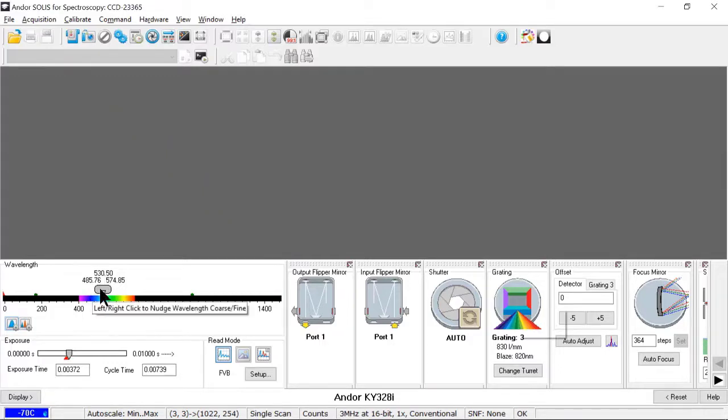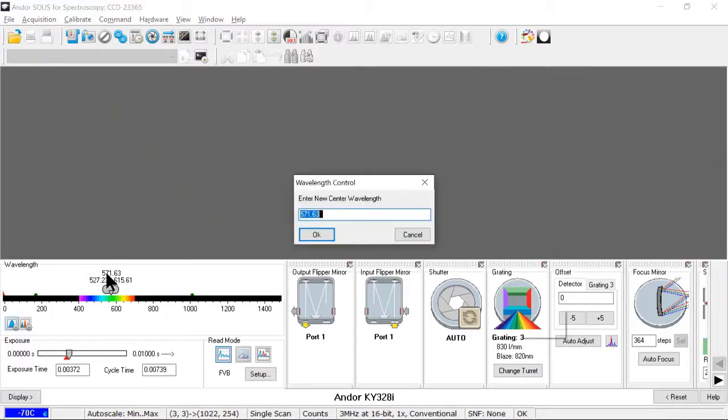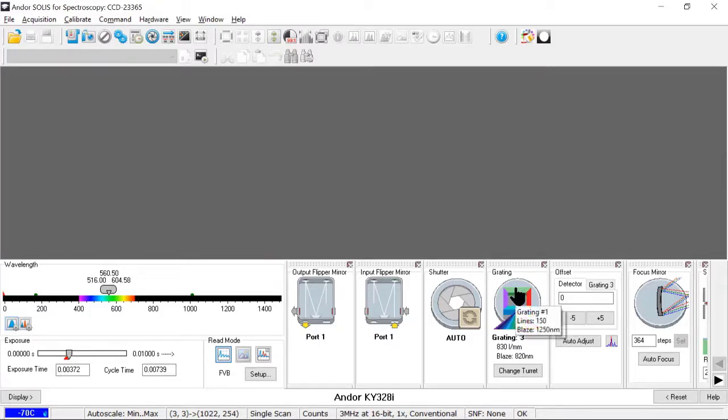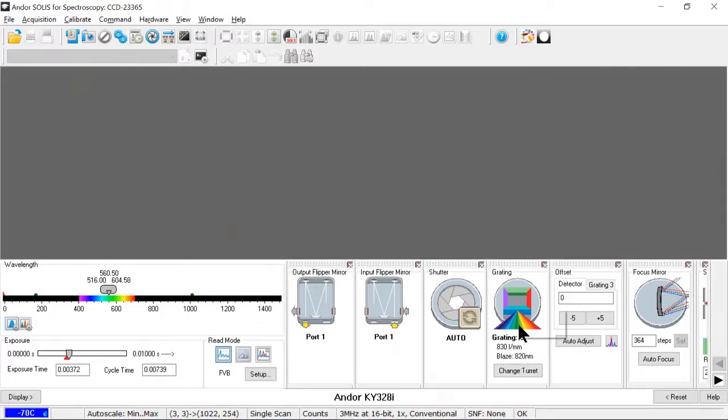I can either drag the bar around manually and do a grating move, or I can click on the low, center, or high wavelength and set those manually. So here I'll set a center wavelength of exactly 560.5. And here's the grating selector. I can mouse over to see what gratings are present, and I can click to change the grating. So my current grating is 830 lines per millimeter, blaze 820 nanometers, and I'm going to change that to 150 lines per millimeter, a 1250 nanometer blaze.